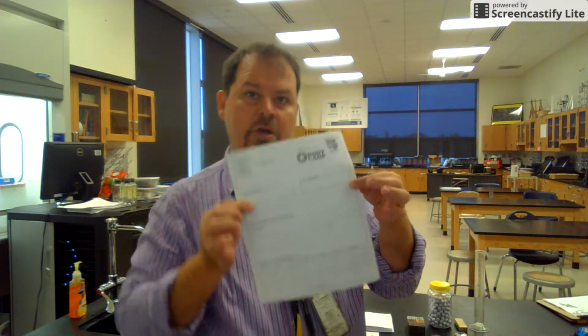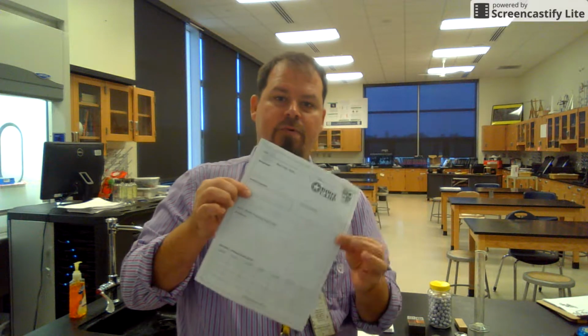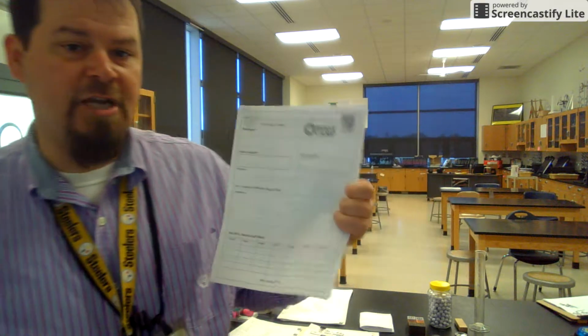You're going to need the density equation and the percent error equation, both of which are in your unit packet and in your reference tables. All right, so you're going to need to do that. The purpose of this lab is to use density to identify an unknown metal. So that's the purpose. And then the procedure: density of regularly shaped solids.